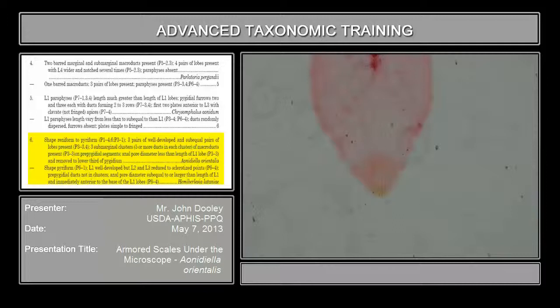Reniform would mean — you very rarely see this species in reniform form — but that would mean that these prosomatic lobes all the way on the side will form a huge lobe that will come all the way around, and the pygidium will usually be sunk inside and flanked by two huge lobes. Reniform meaning kidney-shaped. The other one, A. nidiella arancii, on citrus, is usually found reniform and very rarely found this way, and they're both the same genus.